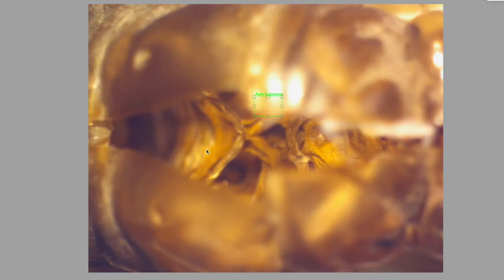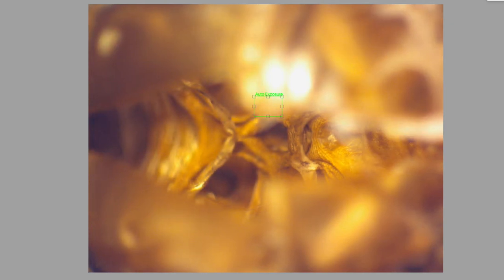Oh, wait. I wanted to go back to 10x. I wanted to change my... Okay. Sorry. I'm not thinking. Gosh. Look at the wrinkles on that. The texture in there is just absolutely stunning. Okay. Bring our focus out.